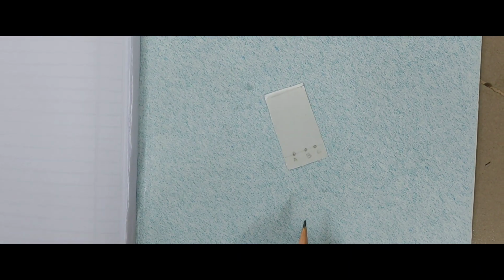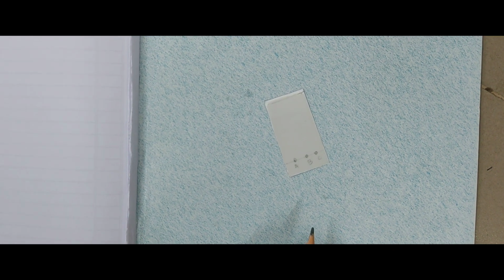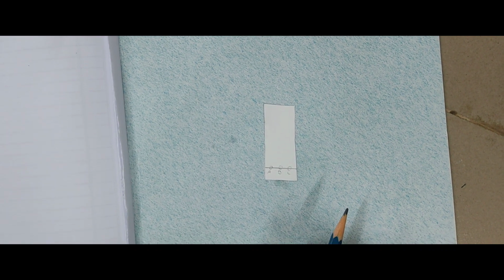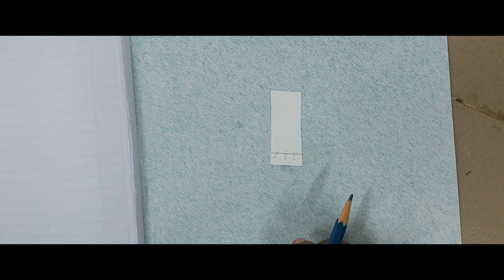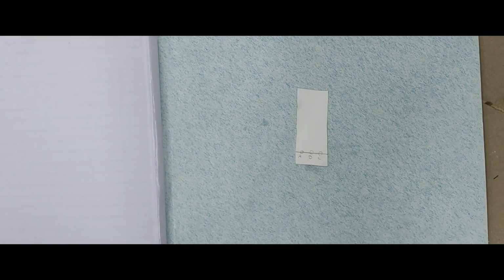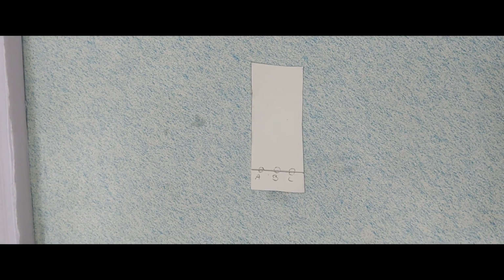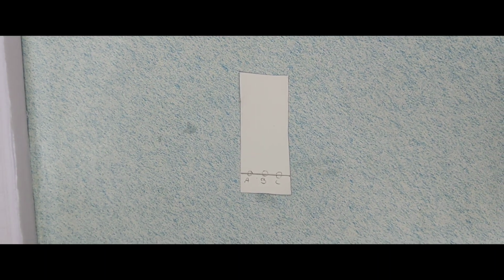Now the plate is air dried. After drying, you observe that the plate shows no color spots. For visualizing the color spots, we have to spray a reagent. The reagent was prepared according to the IP monograph for the identification of diclofenac injection.